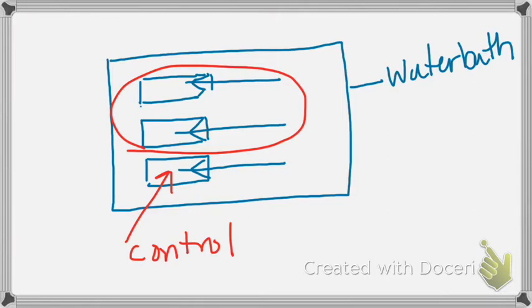So those are my recommendations. I do want you to have a comparison between at least two different experimental treatments. You could do 3, but then you need to make sure that you can produce averages of them. So if you're going to do 3, you have to figure out how they're going to be put into the water baths.